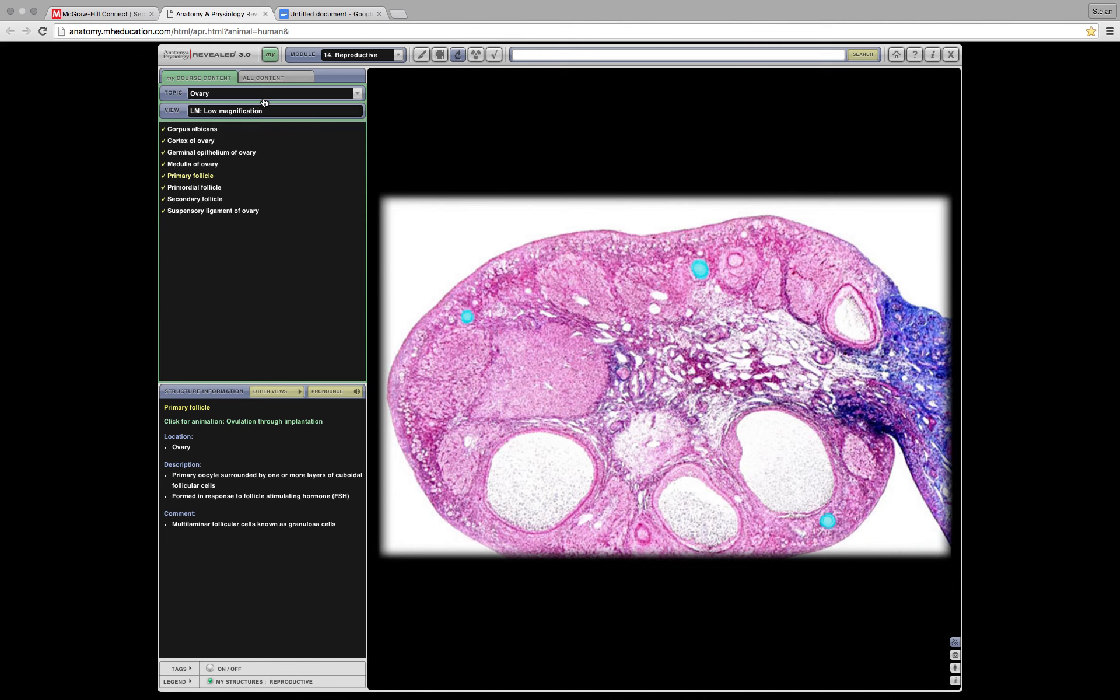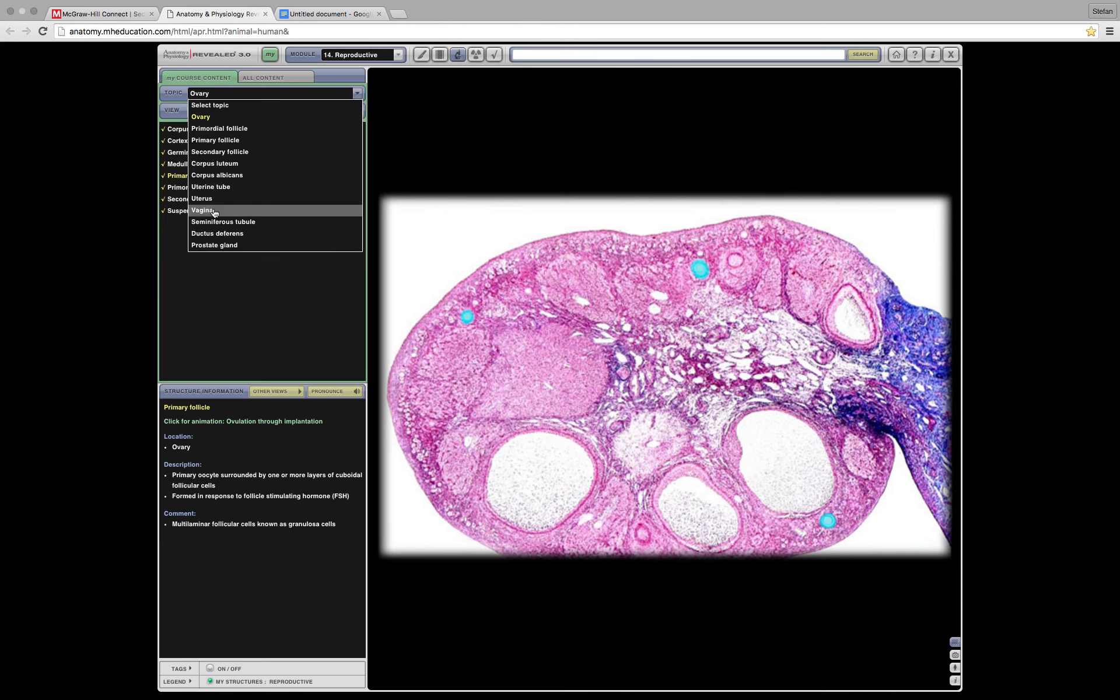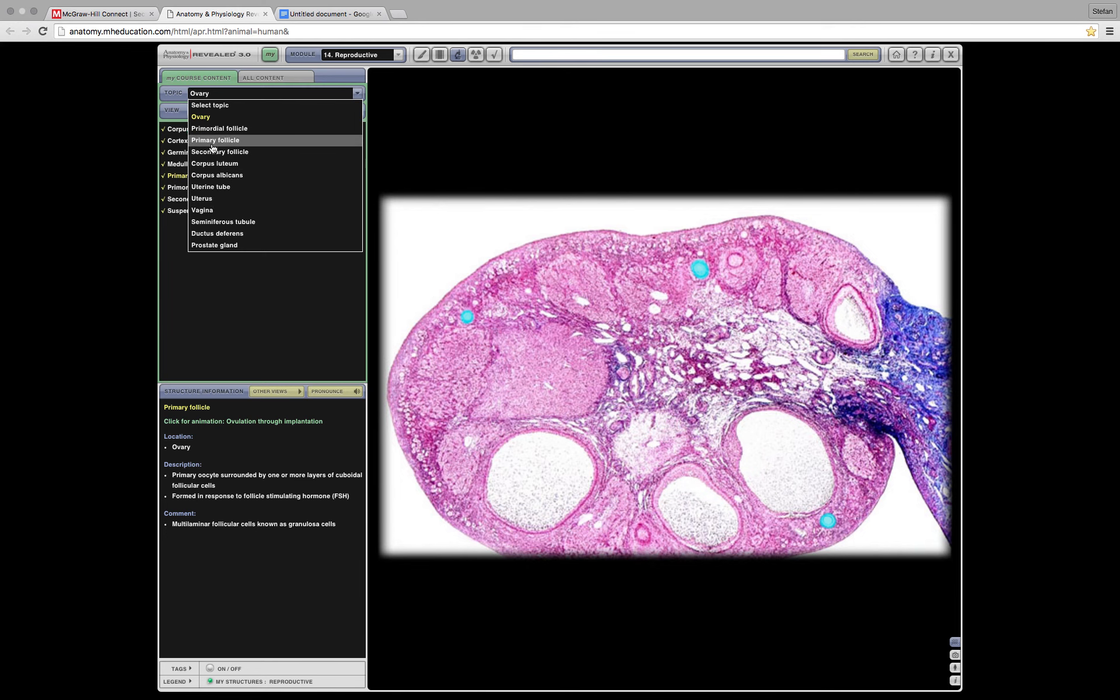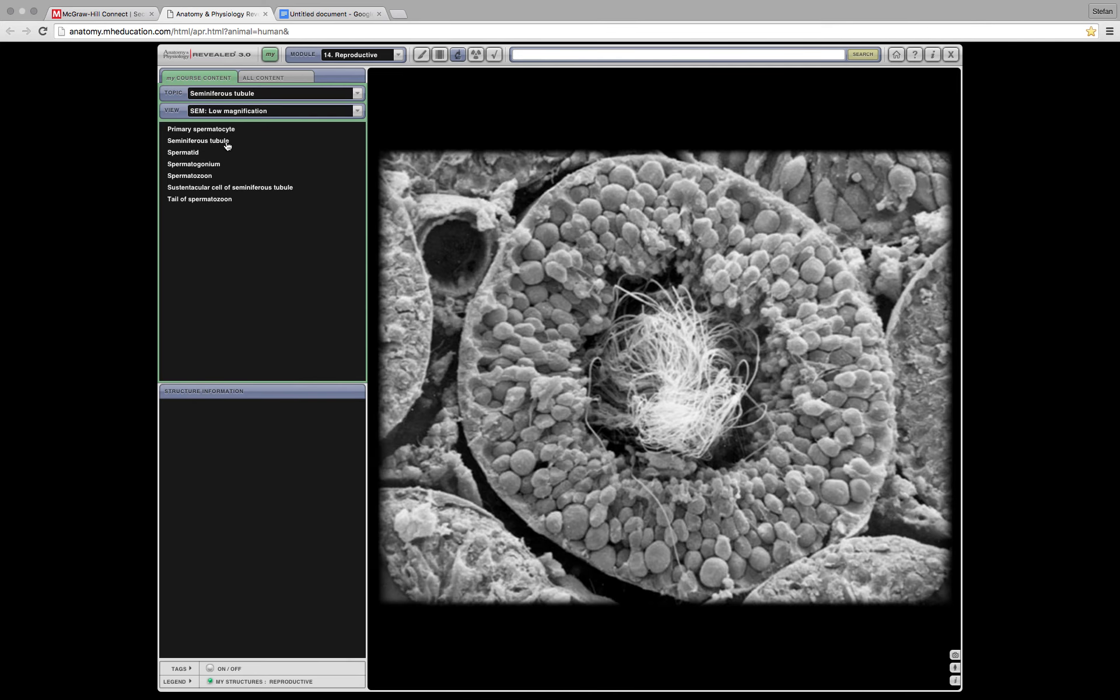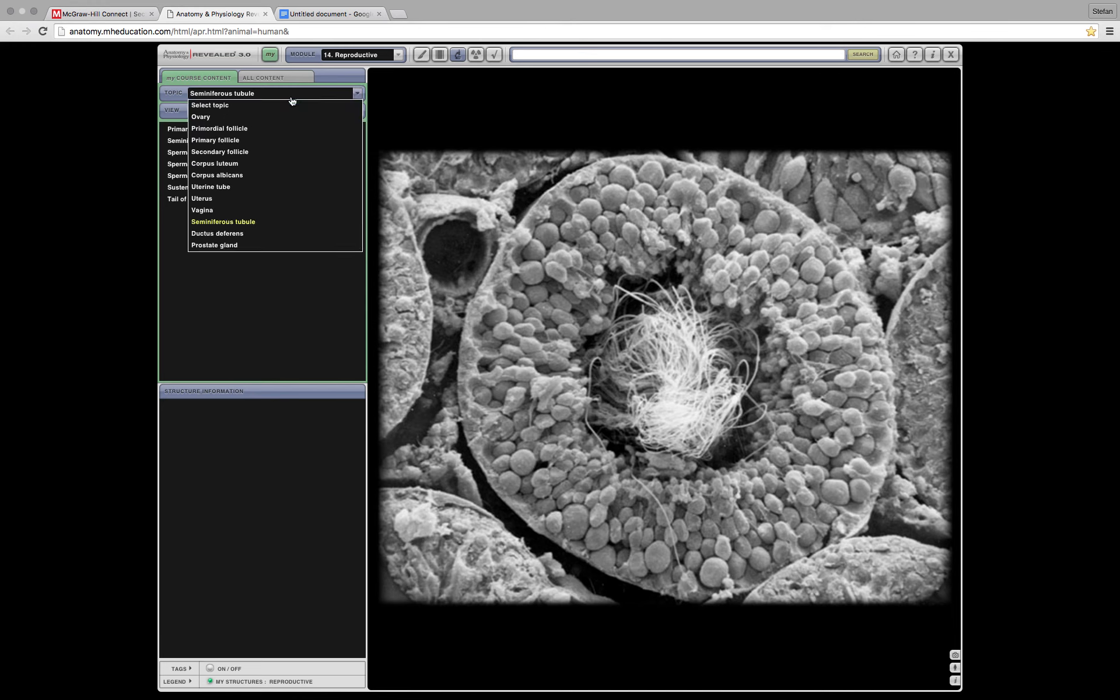Next we have the corpus luteum, which I crossed out, which means it's not going to be on our exam. And then we have the testes. Where would that be? Uterus, seminiferous tubule. Yeah, you could say that. Low magnification. This is not a slide. This won't be on our test. Primary, secondary, corpus luteum.